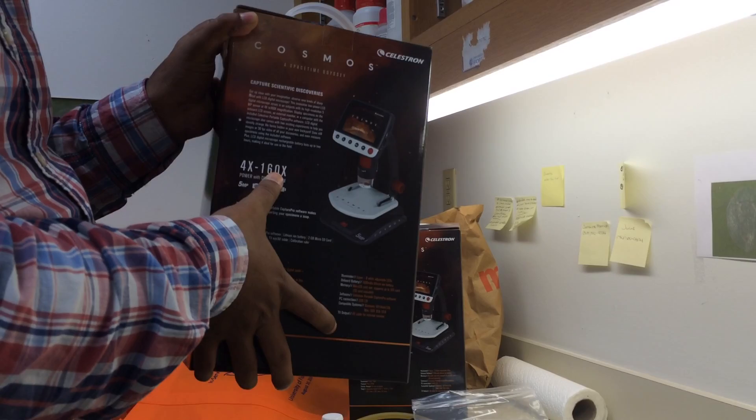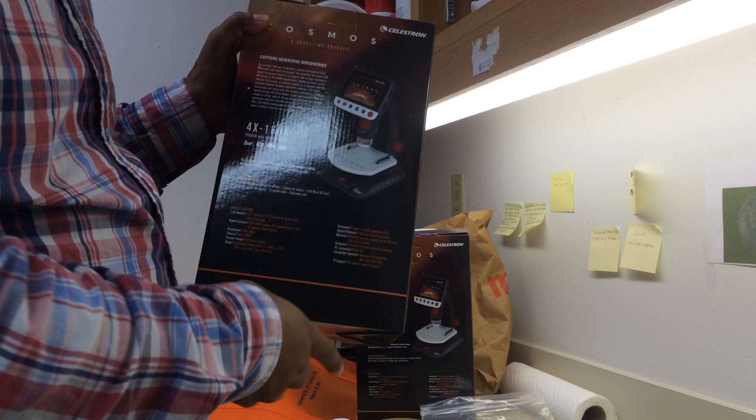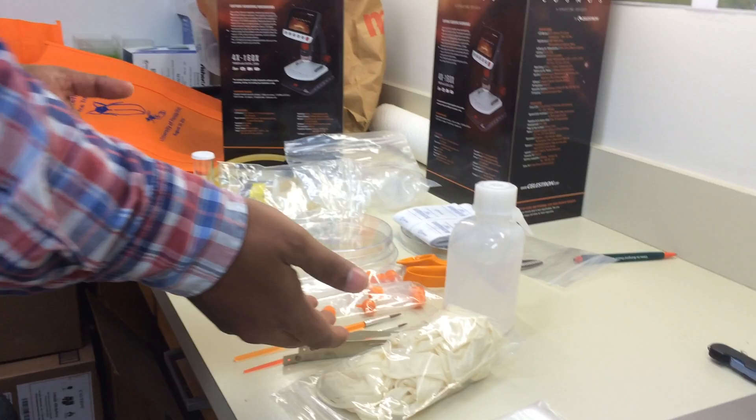To observe your samples, we have provided a digital microscope inside the kit. This microscope has 10x to 160x zoom and can take pictures and video. I will give a separate video introducing this microscope and how to use it. Once you collect your samples, you handle them with the camel hair brushes and forceps and observe them under the microscope.